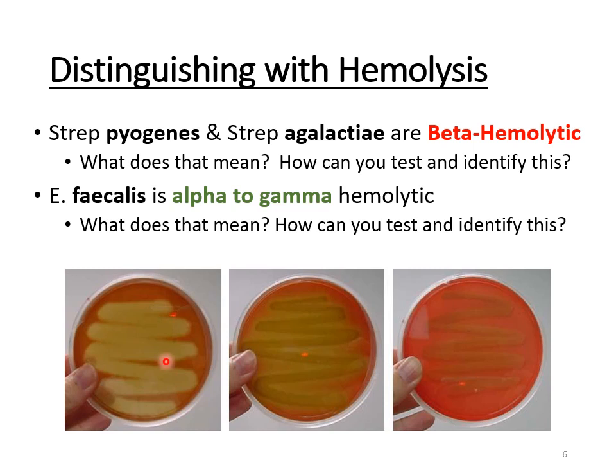The middle one has turned a greenish, brownish color because that's alpha hemolytic activity, where the bacteria started to break down the red blood cells a little bit, but didn't fully break them down. So you can't completely see through that plate now. The last one is gamma, where there's no breakdown and the plate looks just as solid red as before. So you won't see the light really shining through.